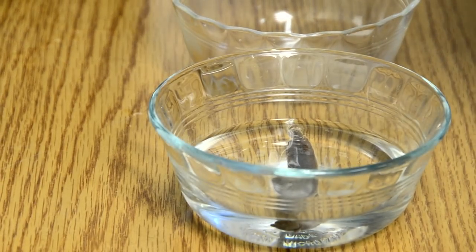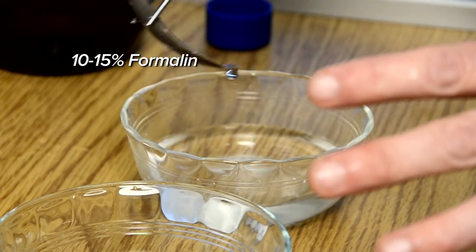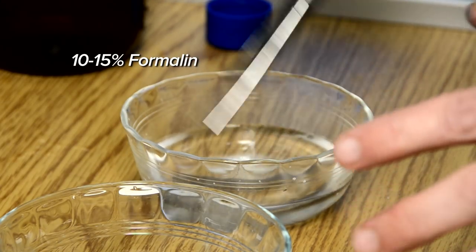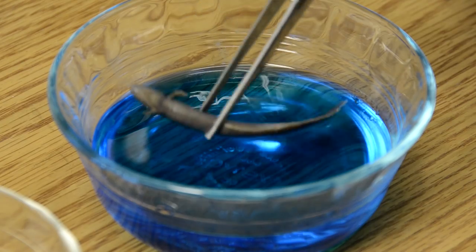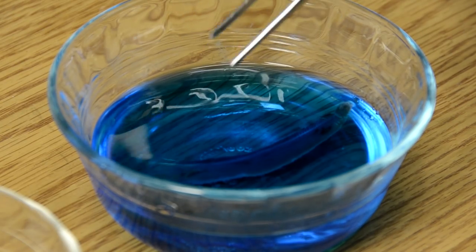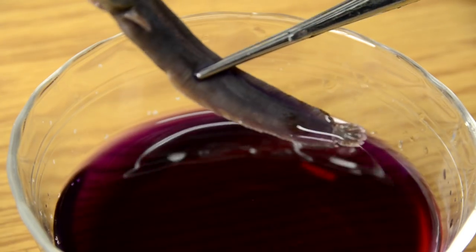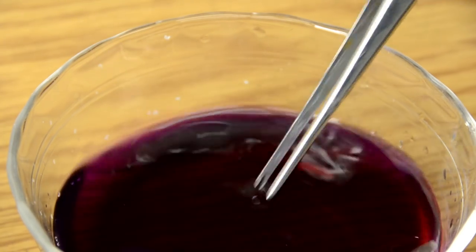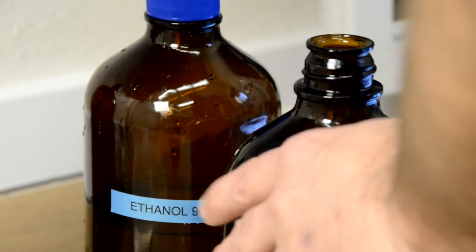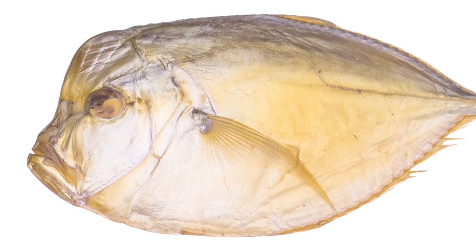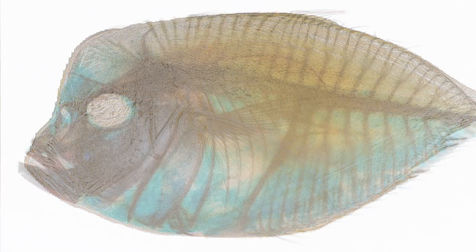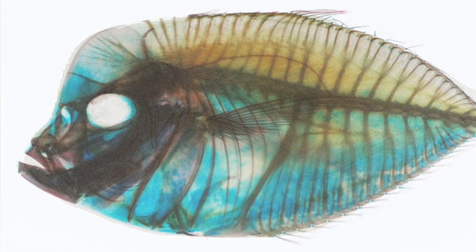Clearing and staining is not a new technique. This is an old technique and it's a very simple technique. The first thing you do is solidify all its tissues. Then you stain all of the cartilage bright blue and all of the bone bright red. At this point you have a fish that looks just like a fish that's as stiff as a board. Then we put the fish in trypsin which eats up basically almost everything in the fish except collagen.